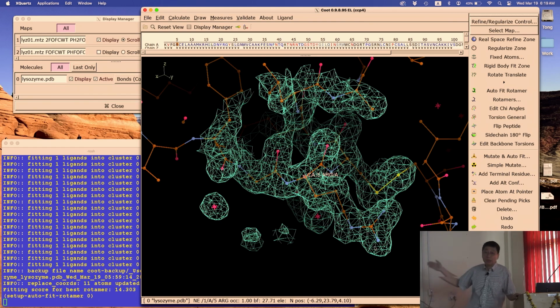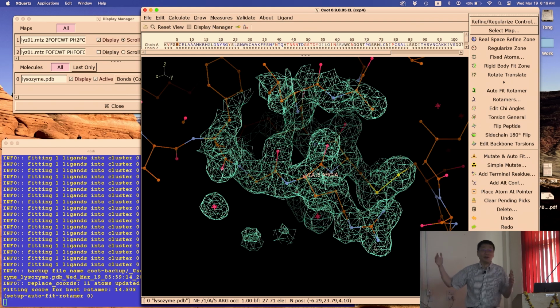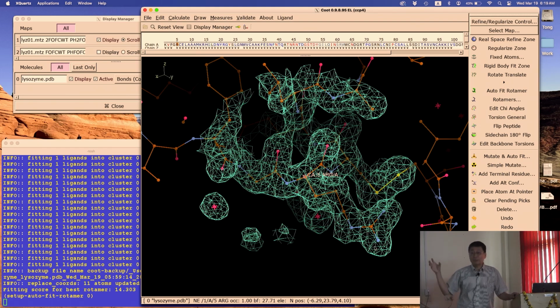As I said, it's a steep learning curve, but I'm happy to see that we are now on the same page. So you are at least making inroads into this program. Practice makes perfect. So now you have my primer, all that stuff. Play around. I'll be here for 2 more days. So if you have questions, grab me. I'm happy to help. Okay? And I think that's all I'm going to say about Coot today, in the interest of time as well.